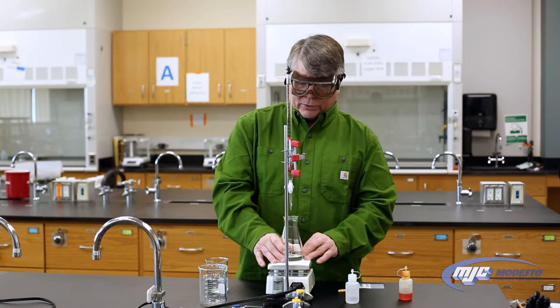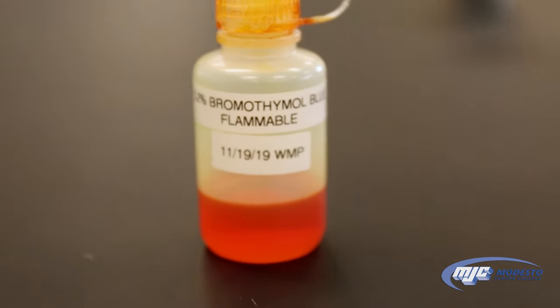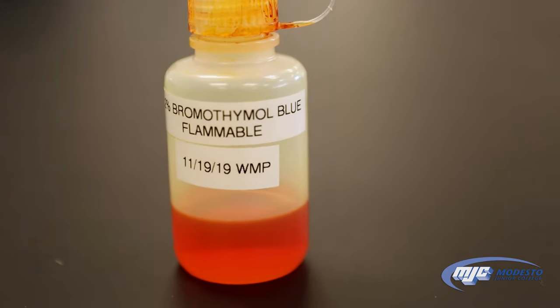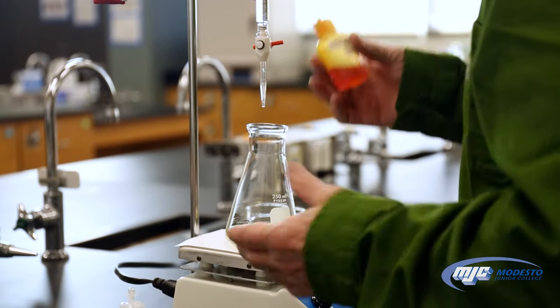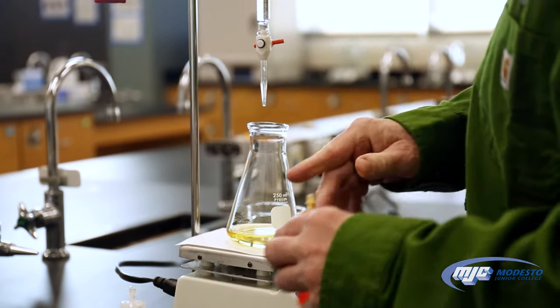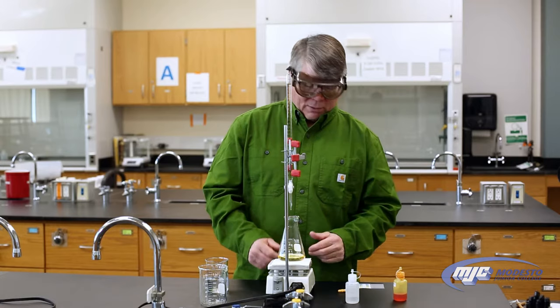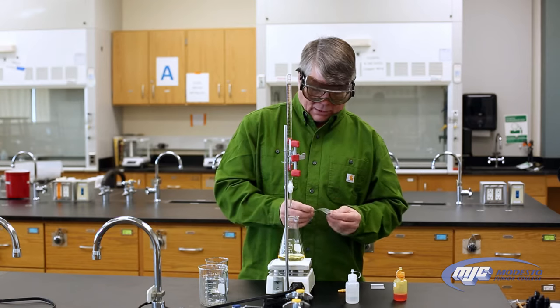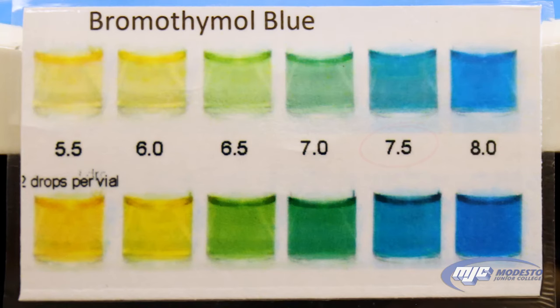To know when we reach the equivalence point, we have to add an indicator. This is bromothymol blue, so we want to make sure we put a few drops — three or four — in here. Bromothymol blue, as you can see, is yellow when it's in an acid solution. It's going to turn color, and what we're looking for is a color that correlates to a pH of about 7.5.